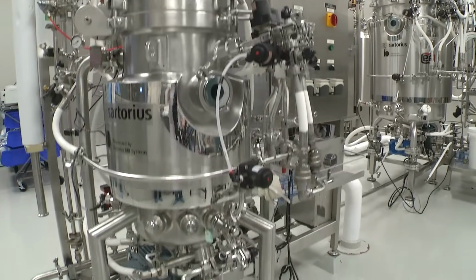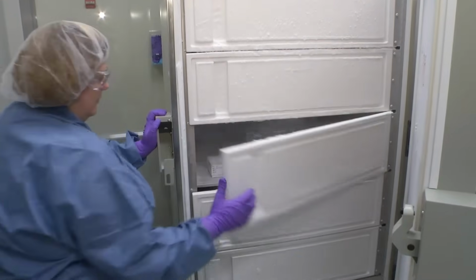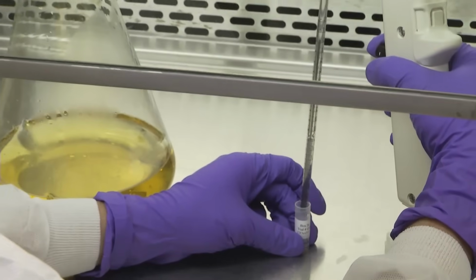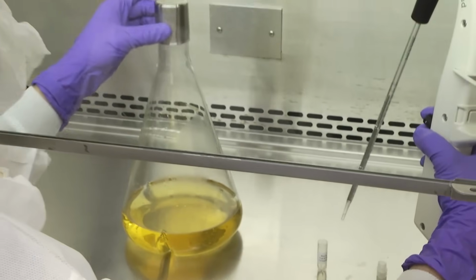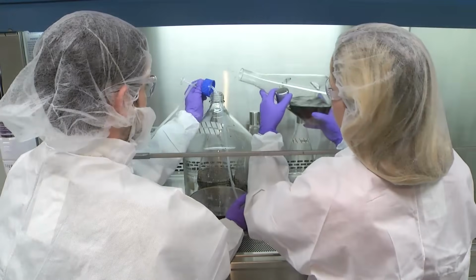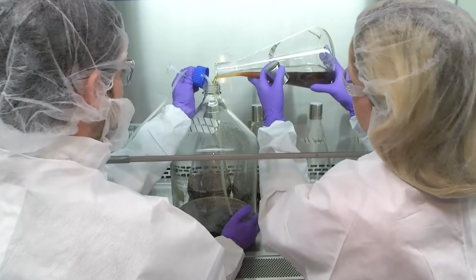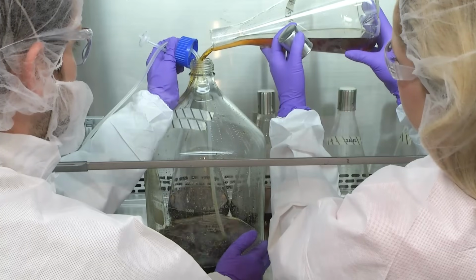Fermentation is a reasonably simple process. A cell is selected based on its ability to produce the desired product. A seed stock of cells is put into a small amount of media. Media provides the nutritional products the cell needs to grow. When the population of cells has grown and consumed most of the nutrients, it's moved into a larger vessel with more growth media, and the process repeats.